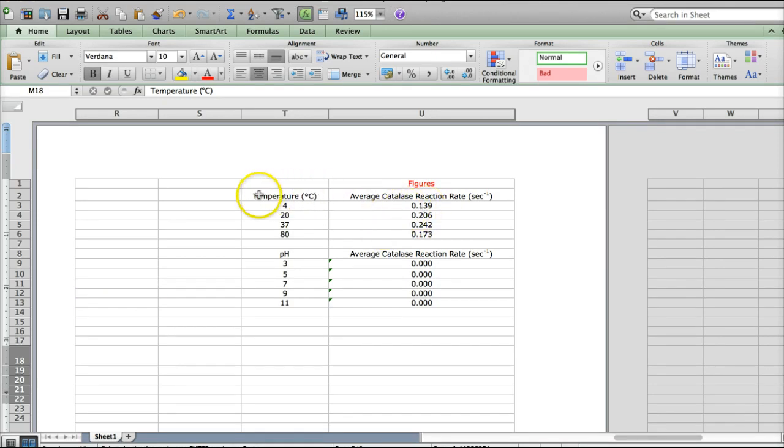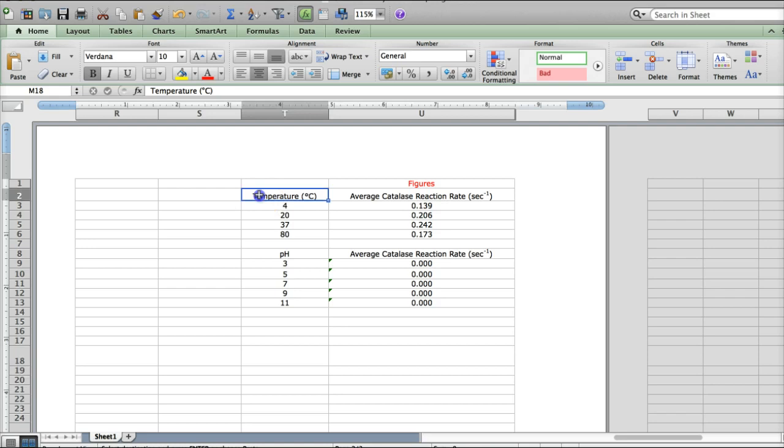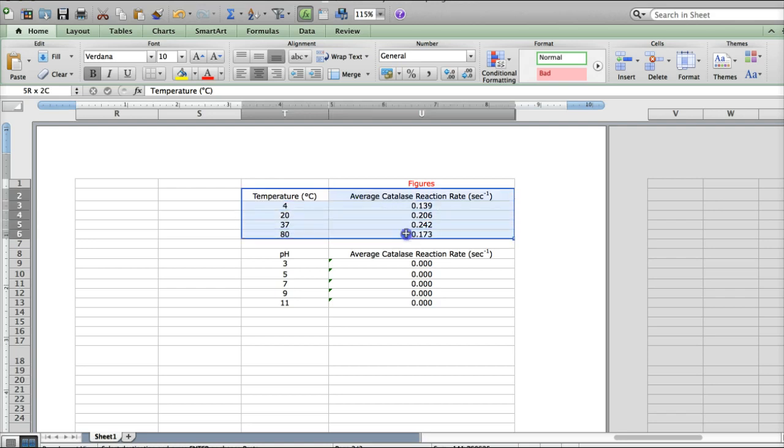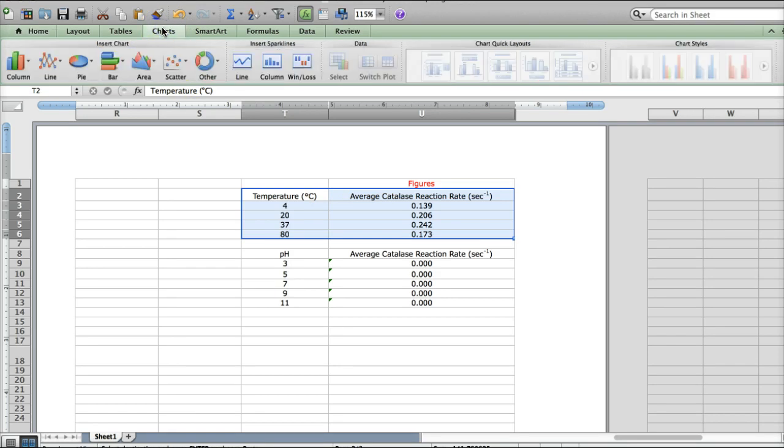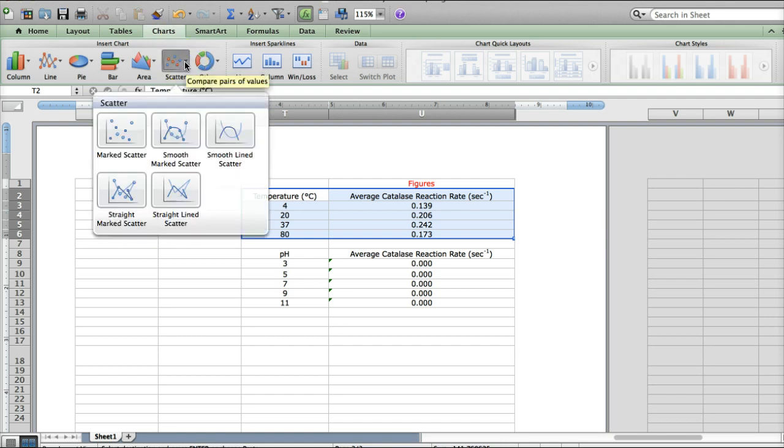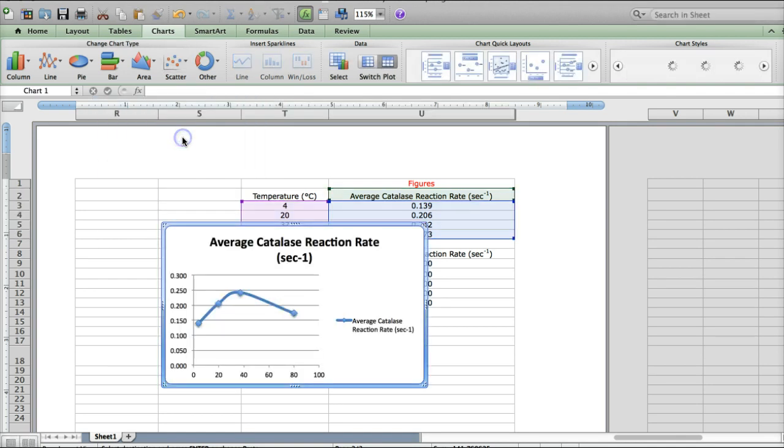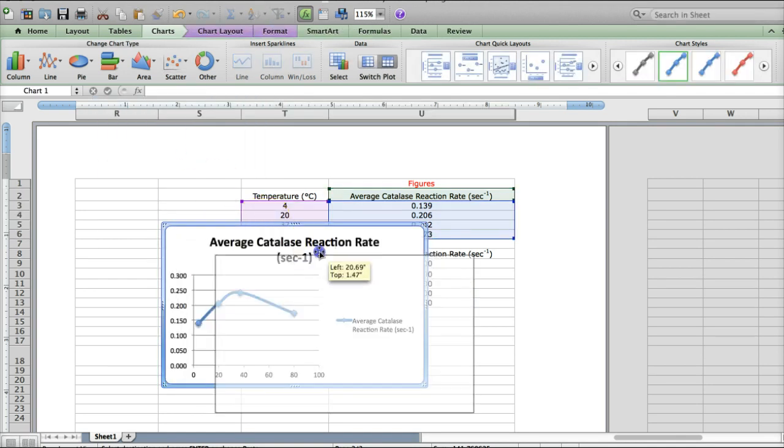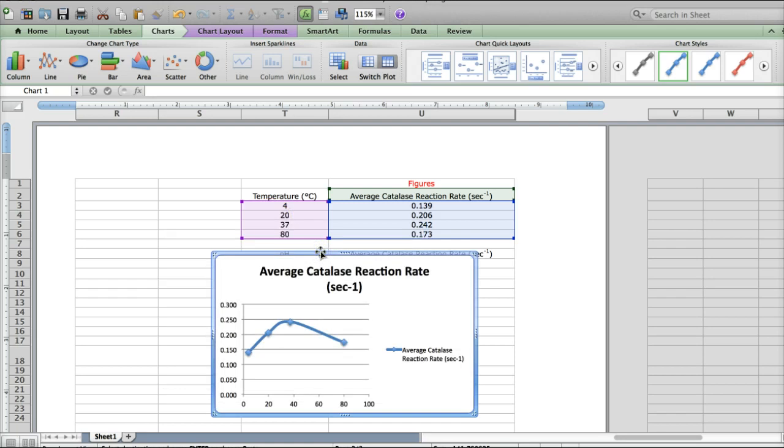All you need to do to make your graph is select all of this stuff. You're going to go up to Insert or Charts, depending on whether you're using Mac or PC. And you're going to want to pick a scatter chart with smooth marked scatter. So this option right here. And you should see something like this.